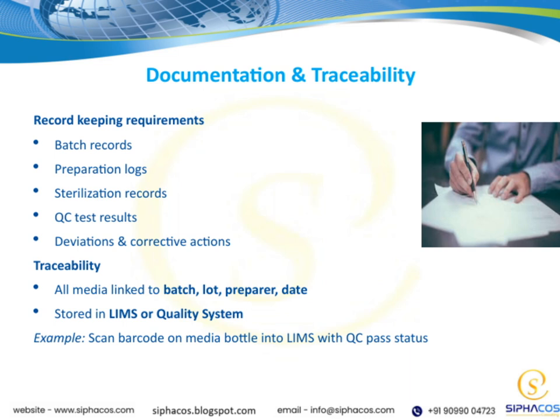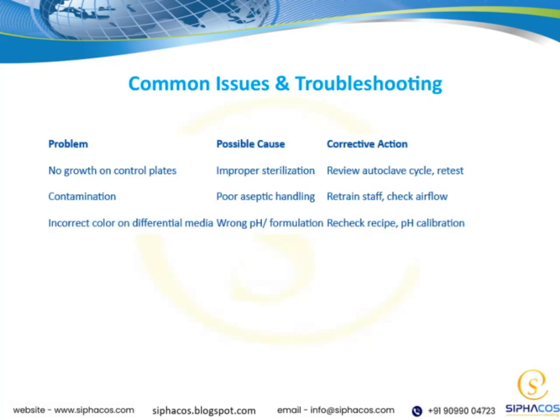All of these elements work together to maintain compliance, ensure quality, and facilitate effective investigation and resolution if any issues occur. Let's take a look at some common issues you might encounter and how to troubleshoot them effectively. When dealing with problems, the first step is always to identify the specific symptom or error message. This helps narrow down the root cause.